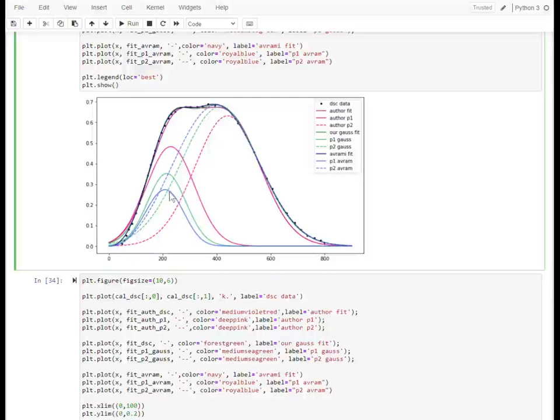The other issue is that when you take these P1 and P2 peaks, they usually try to pull some Avrami kinetics out of them. Well, Avrami kinetics for a Gaussian is completely off. The shape is all wrong, and so they're getting some n values that don't make sense at all, versus what we get here for the blue curves, which we can analyze and actually come out with some kinetic values. So a lot of things wrong with that paper.